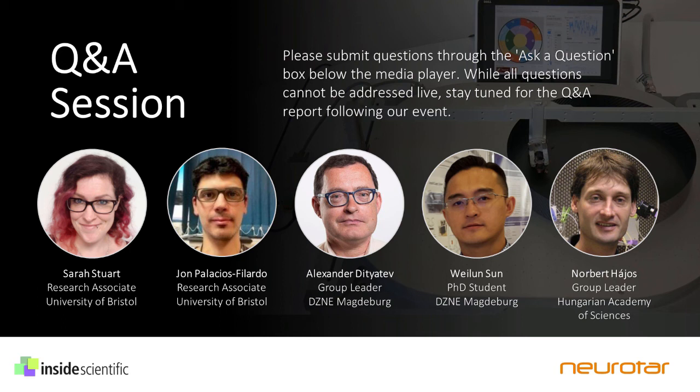Yep. First, we habituate the mice for 3 days in the mobile home cage, usually twice a day for 10 minutes. Then we start the training. Training usually takes 7-10 days. And we have found that mice learn faster if their whiskers can touch, from time to time, the wall of the mobile home cage platform. So we think this is a critical factor, the touching of the wall by the whiskers.